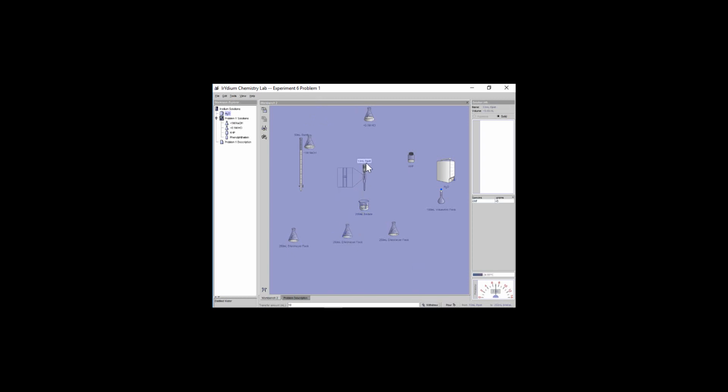10 mL KHP solution that I know really well. You should label these ones here so you don't get mixed up. And basically we're ready to do our titration. KHP is our acidic standard. It's going to acid-base neutralize with NaOH. We mentioned I need to cheat a little bit by adding phenolphthalein. Phenolphthalein is an indicator. You won't need a lot of it. It can come to you as a solid, but pretty much it's going to be in dropper and solution form anyways. I'm going to drop this into my Erlenmeyer flask. Because in the Erlenmeyer flask it's an acidic solution, it's going to stay colorless. As I slowly drop in the base, however, it's going to actually show when that color change occurs.